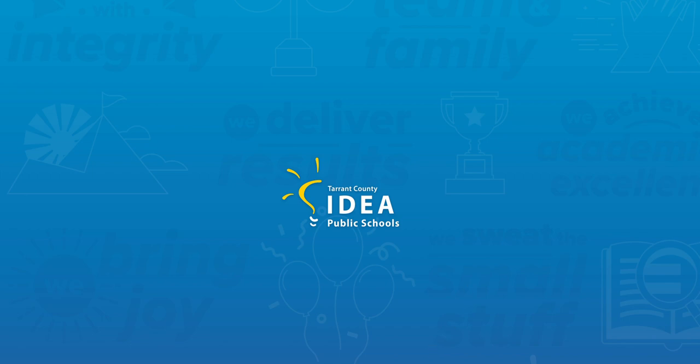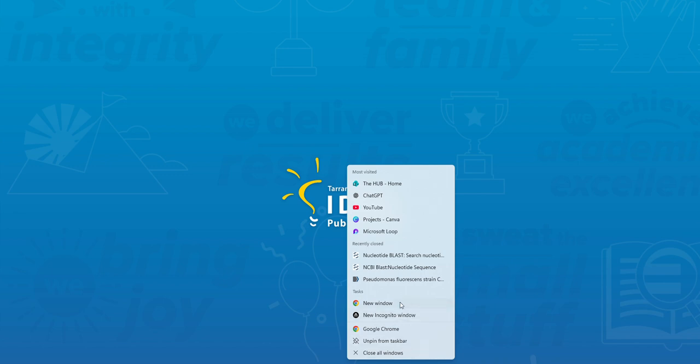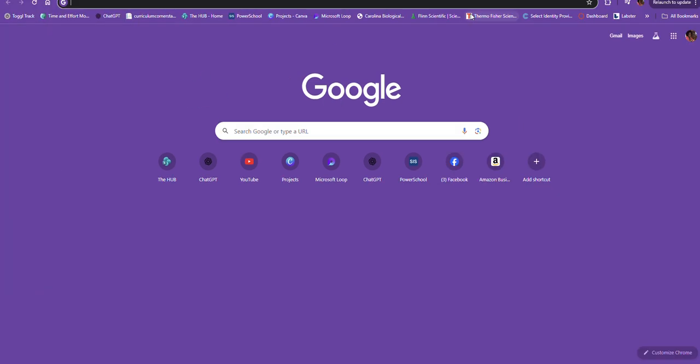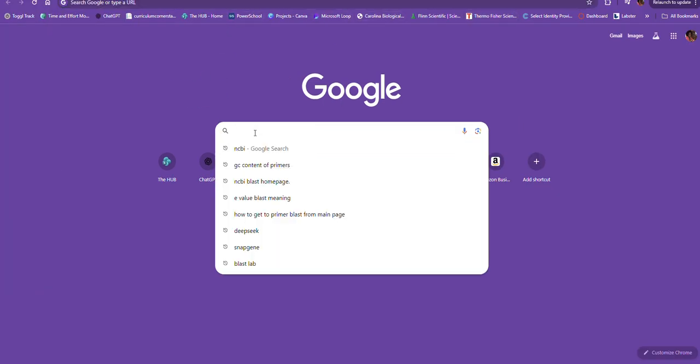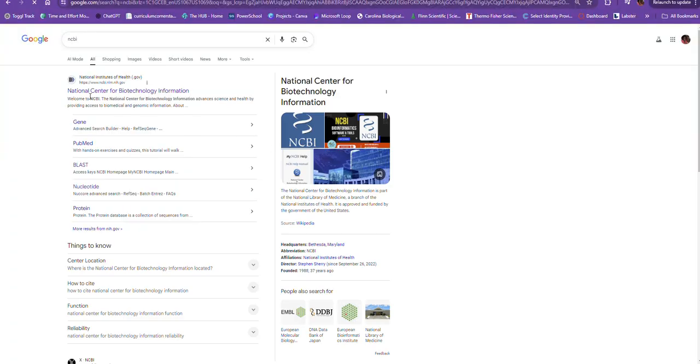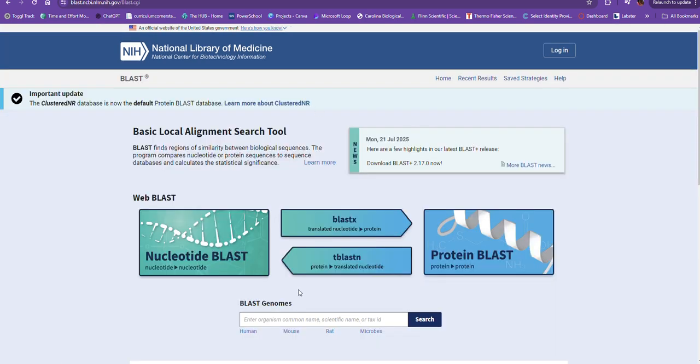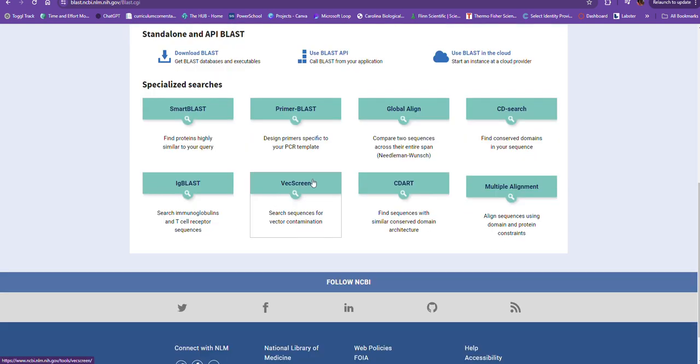Let's open up a page for the NCBI website where we'll start all this. So I'm going to type in NCBI and it's already there for me. Go to the main page and click on BLAST. Once I'm on BLAST, I'm going to scroll down to Primer-BLAST. And this is where I'm going to make my primer.